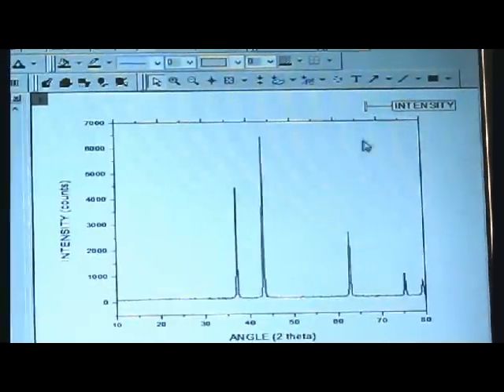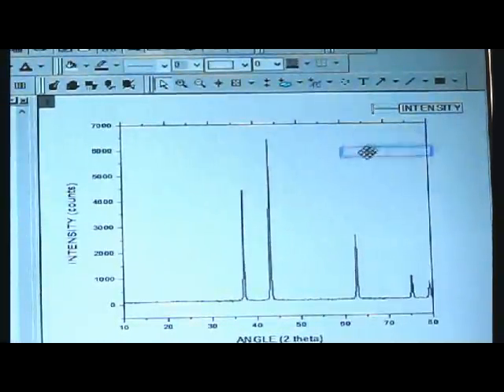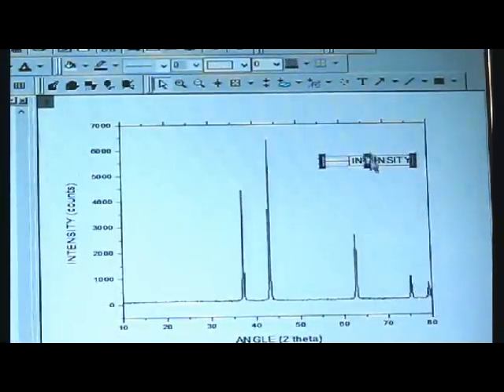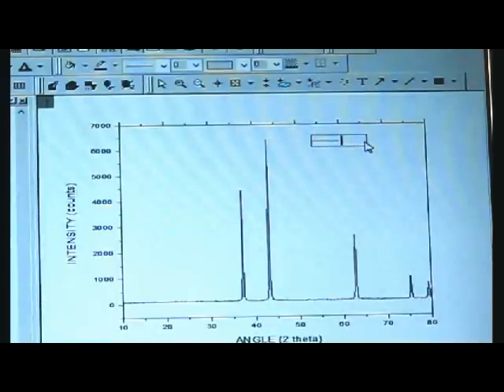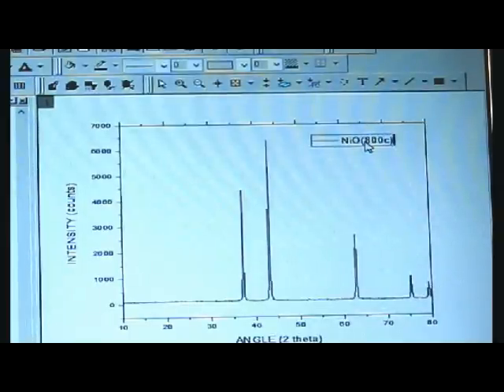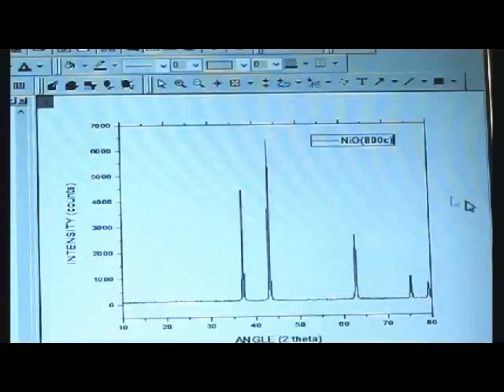Also we can modify it in another way. We can place this bar within the curve. And we can write the sample's name. That is, we are given the sample NiO at 800°C. This is the plot of given XRD data.